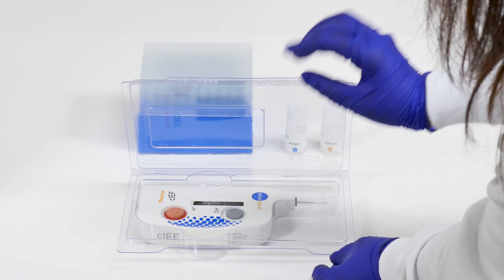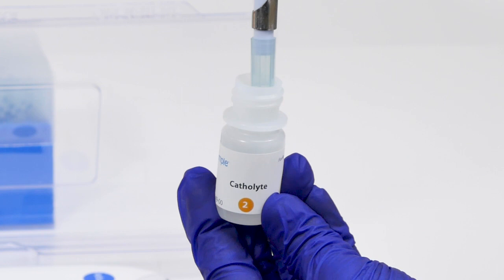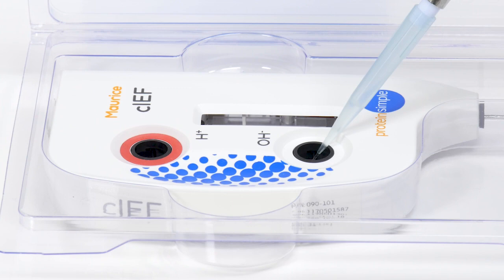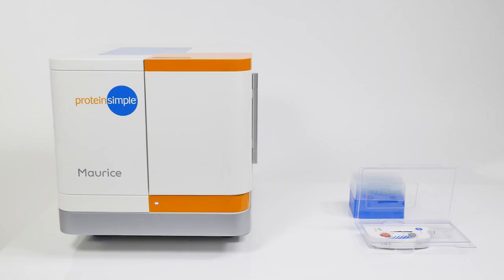Place the CIEF cartridge flat on the bench and remove the plugs from the anolyte and catholyte containers. Add 2 milliliters of catholyte solution to the port labeled with OH⁻, taking care not to stab the membrane contained within the reservoir. Next, add 2 milliliters of anolyte solution to the port labeled with H⁺. Replace the gray and red plugs into the appropriate openings. The cartridge is now ready to be loaded into Maurice.